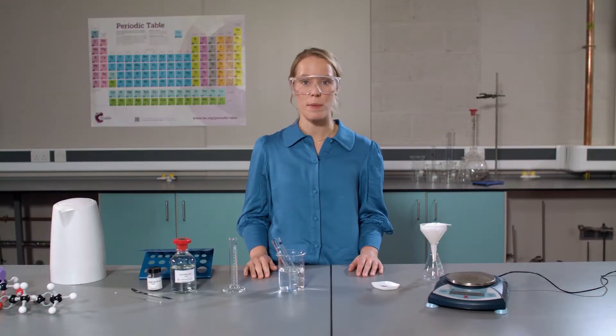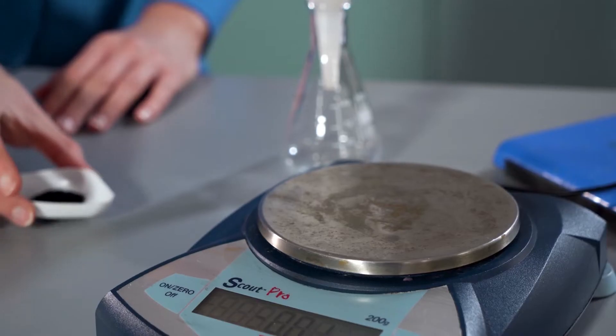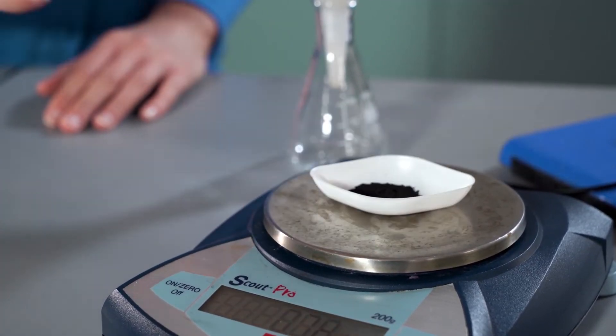While I wait, I will prepare the base. I need to measure out between 1.8 and 2 grams of black copper oxide powder using a measuring boat.